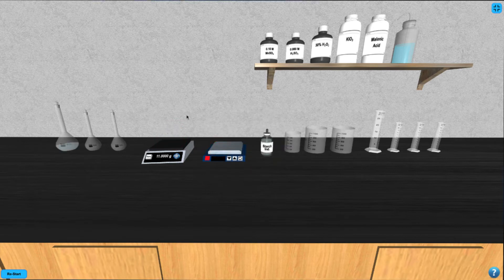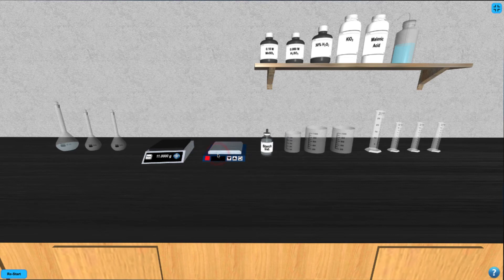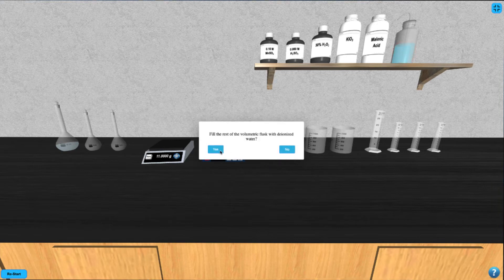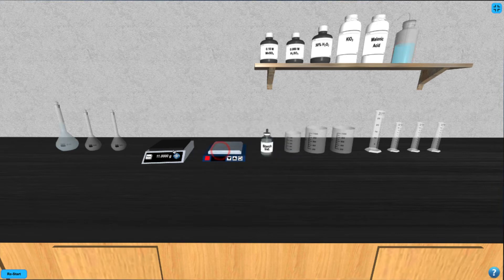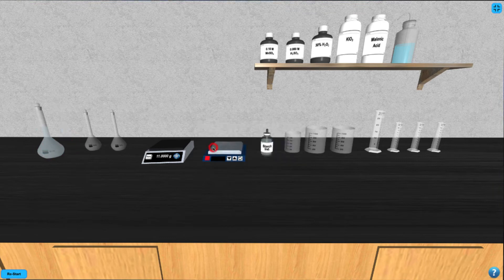Next, click on the manganese sulfate bottle and enter the volume of manganese sulfate you wish to add into the volumetric flask in units of milliliters. Click on the deionized water bottle to fill the rest of the volumetric flask with deionized water. Then shake the solution by clicking on the volumetric flask.